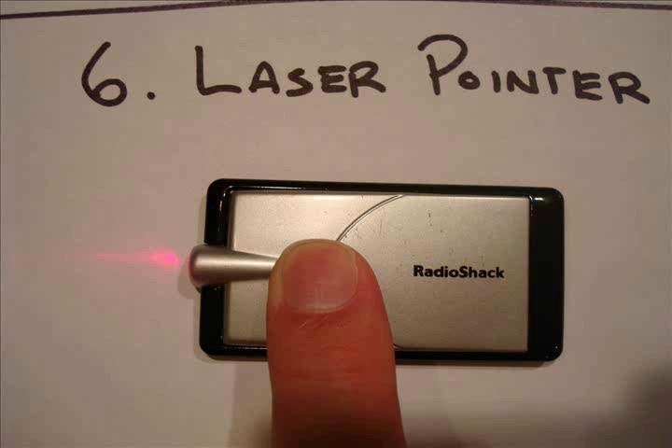The last thing I would recommend you get — it's not required, but it tells you where you are in the process — is a laser pointer. I'll explain why in a bit.